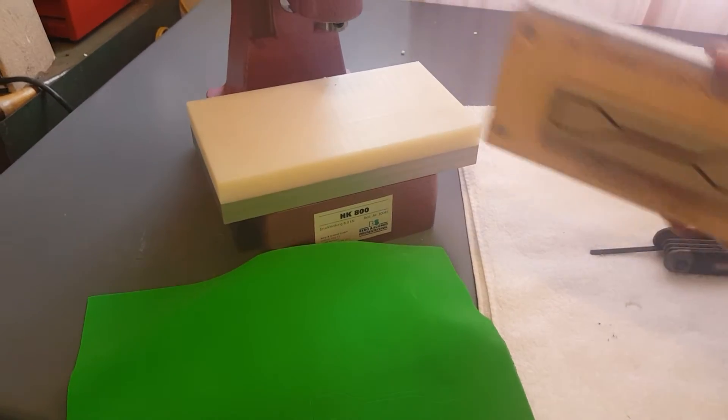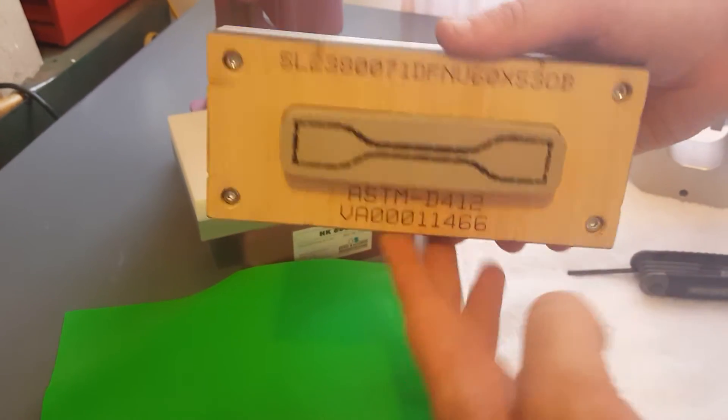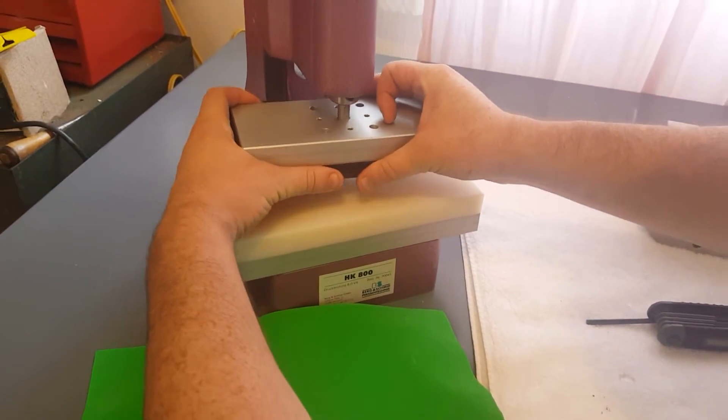Hello, today we are demonstrating the ASTM D412 cutting die. We're going to go ahead and mount this onto our arbor press.